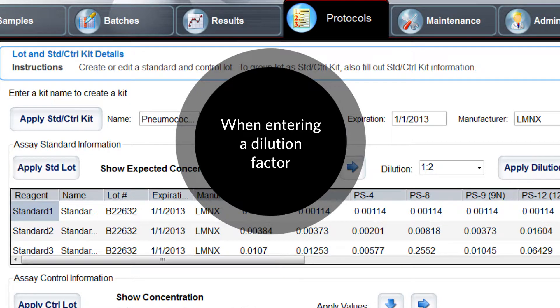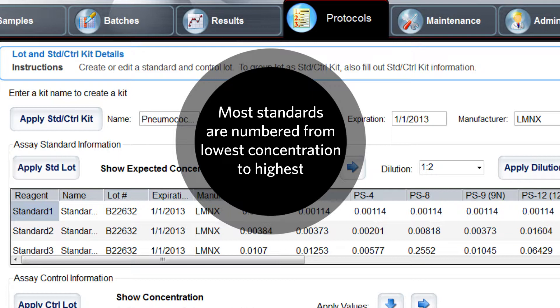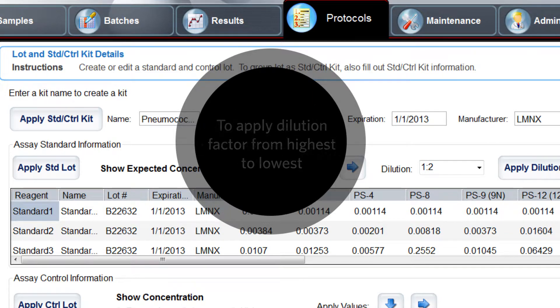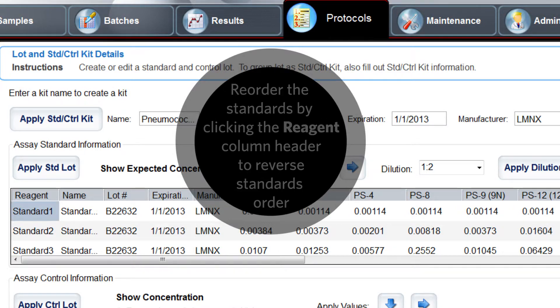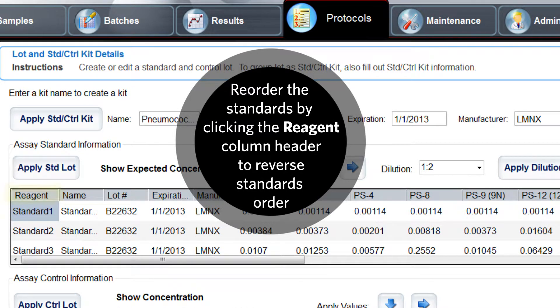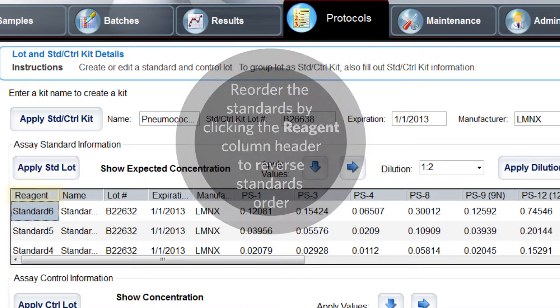When entering a dilution factor, keep in mind that most standards are numbered from the lowest concentration to the highest by the manufacturer. In order to apply a dilution factor from highest to lowest, you can reorder the standards by clicking the reagent column header to reverse the standards order.